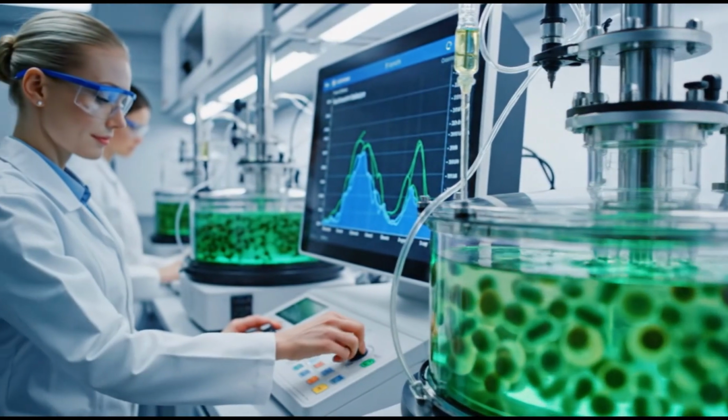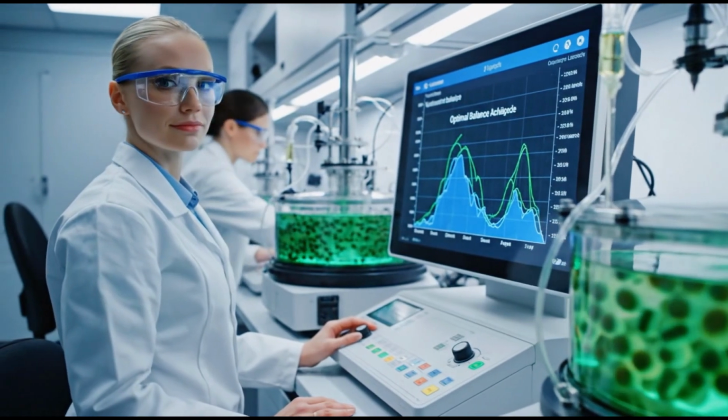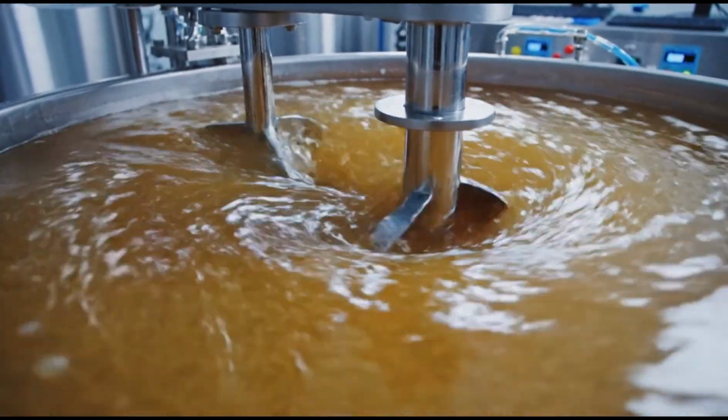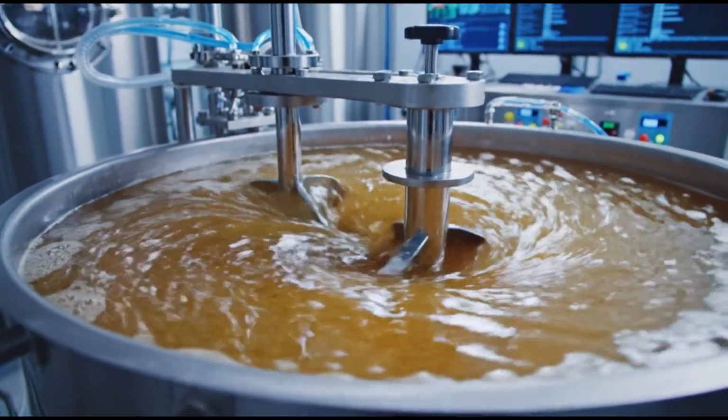Sugars introduced to provide cellular energy source. Automated dosing systems prevent overconcentration. Processing. Essential minerals blended into growth medium. Microscopic nutrient balance carefully maintained.